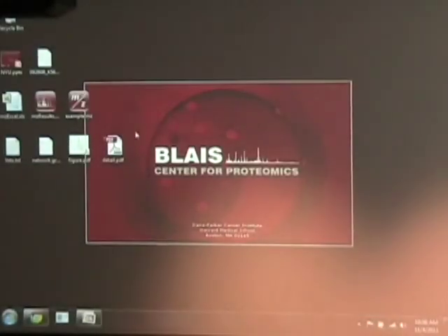You download it, and then you basically just run. It's packaged as an MZ script. Let me show you. So you can pretty much be up and running in a few hours.